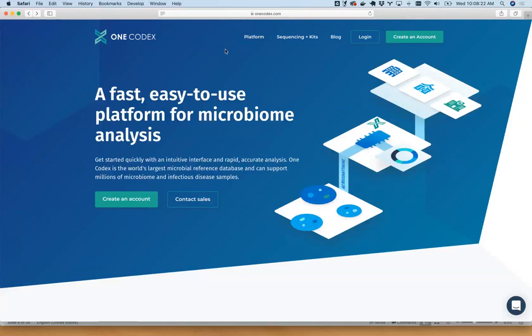I'll focus on providing a very cursory tour, specifically showing how you can get started and analyze LoopSeq data within our platform and some of the properties of that data. We'll do a little bit of comparison, and then we'll turn back to the presentation and go through some more detailed stats, graphs and figures that we've put together comparing the LoopSeq data and the short read data.